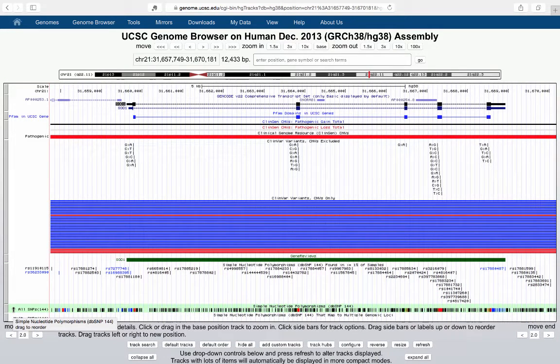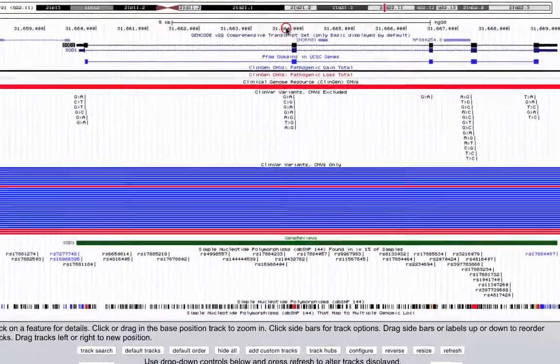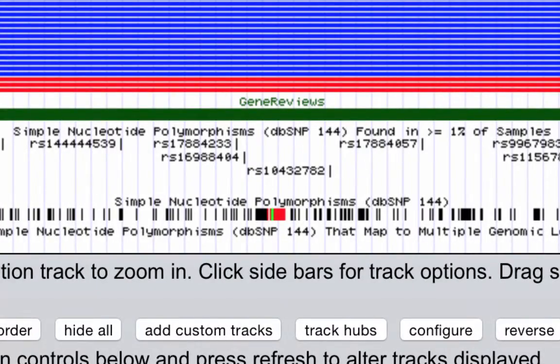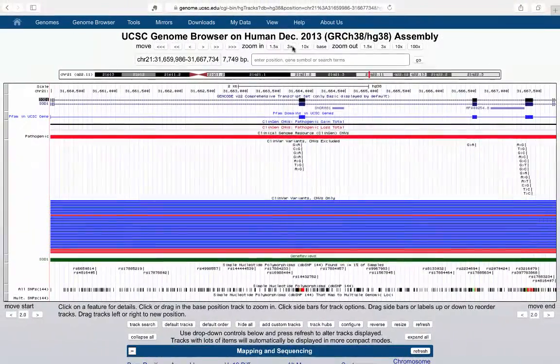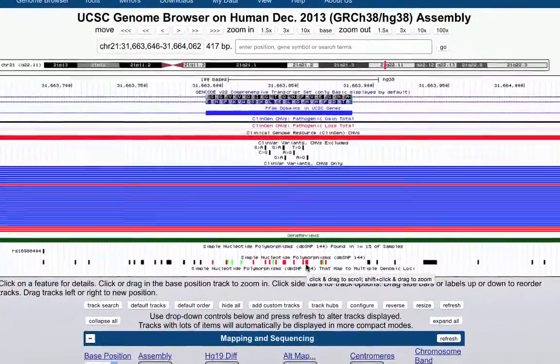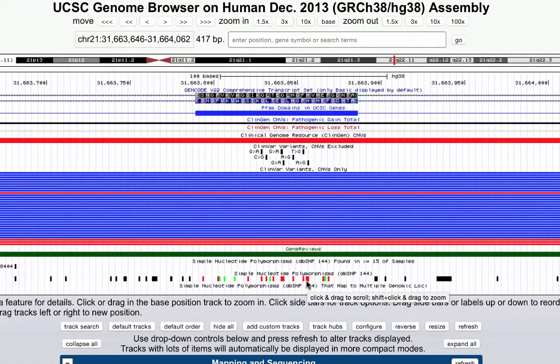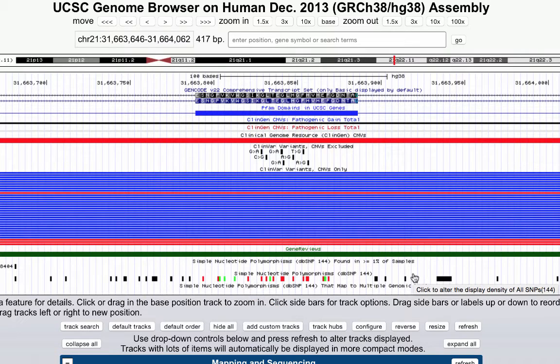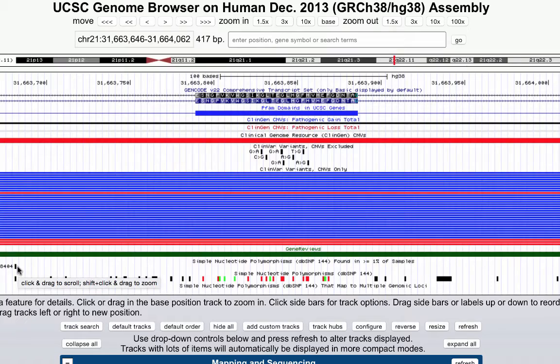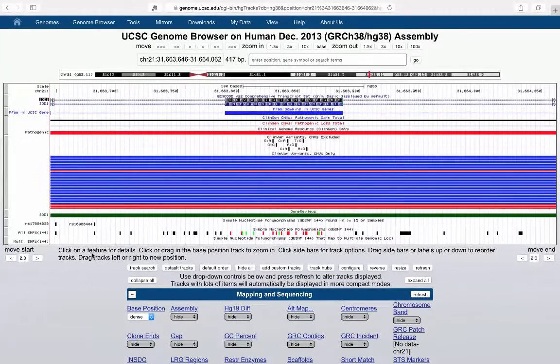The all SNPs track contains all of the SNPs in the dbSNP database. If we zoom in on one exon of SOD1, the common SNPs track is a subset of the all SNPs track. In the all SNPs track you can see rare SNPs located within exon 2 of 5. Some are non-synonymous coding SNPs and some are synonymous coding SNPs — those are in green, and the more deleterious are in red. The common SNPs track has no SNPs reported in this region. Multi-SNPs are SNPs that map in more than one place on the reference; you don't want to select these for a genome-wide association study because you won't be able to get a statistically meaningful association.